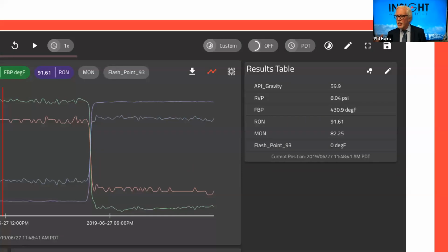What's flash point? And so they build models once we've taken the data sets, huge data sets, lots of data points, correlate them to lab values, build the models, figure out the principal components, do what's called a principal component regression, predict these products.